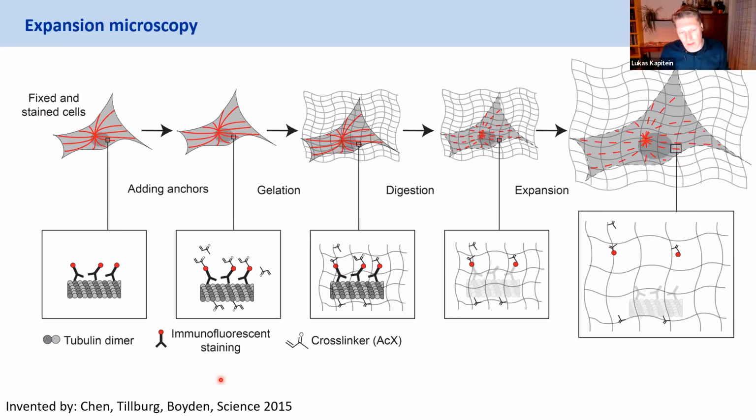This can also be found in baby diapers, or you sometimes have these dinosaur eggs that you put in water, and then the dinosaur inside will swell up and crack the egg and be born. And so the idea, you can actually use an acrylamide gel that you also use for normal protein gels, but you add sodium acrylate, and the sodium acrylate makes this a hydrogel.